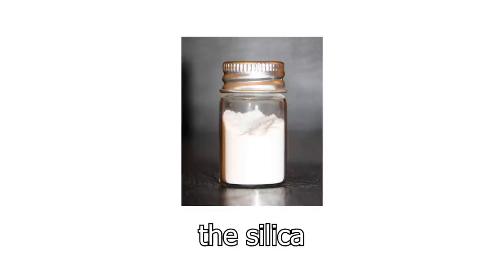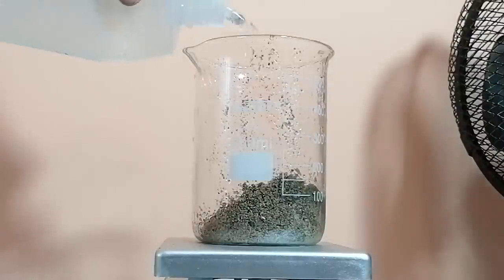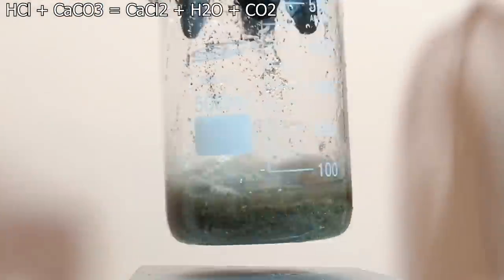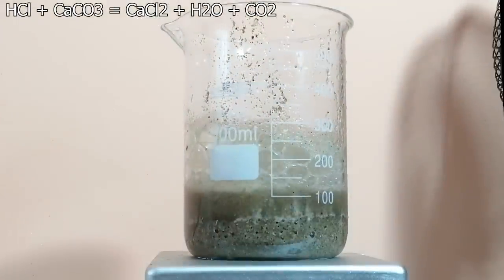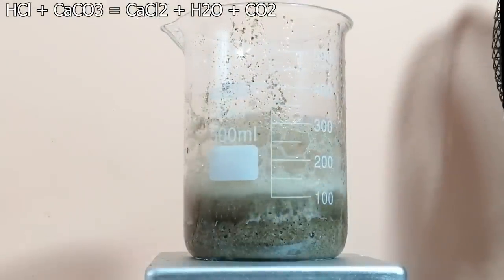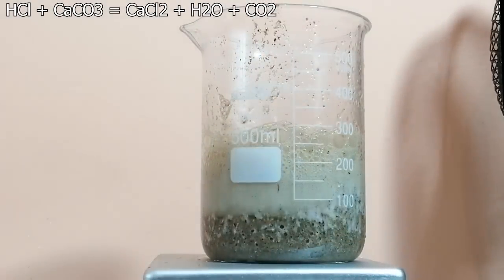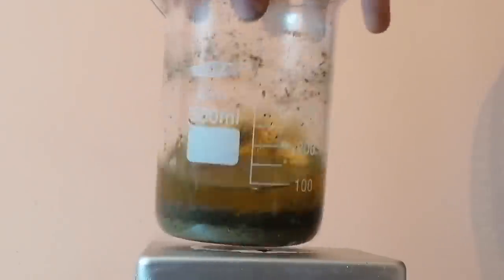But first we have to purify the silica. To start, into a beaker I've added some beach sand. Next I've added some water, then I've started adding hydrochloric acid to it. What's happening here is we are dissolving some of the impurities from the sand. Bubbles are formed due to the formation of carbon dioxide, which most likely comes from carbonates, like calcium carbonate. I've left it for about 30 minutes, and this is our acid-washed sand.